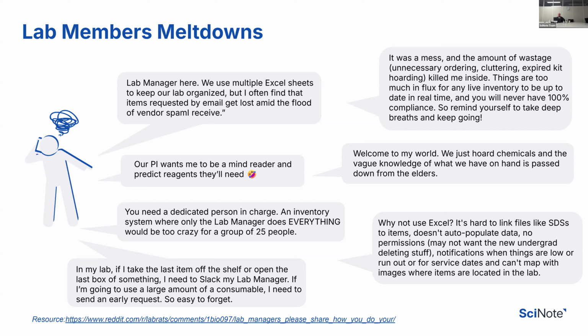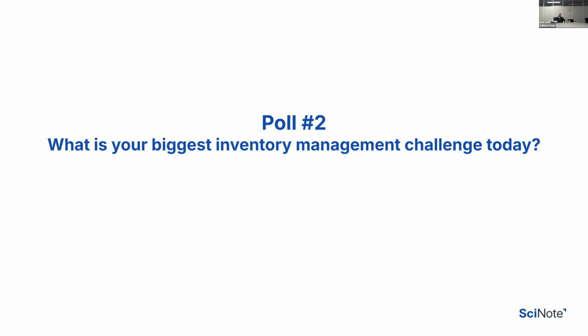Okay, good. What we're going to continue with, this was a nice introduction into the next poll. The next question is: what is your biggest inventory management challenge today? You've seen some that we found and heard about, but we're also interested to hear what you think is your current biggest challenge. I'm sure there are multiple, but what is the biggest one? Just a second, let me start the Q&A session. Okay, I think you should see the question on your screen.